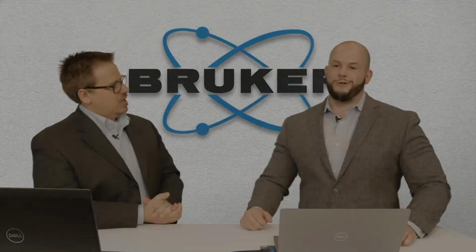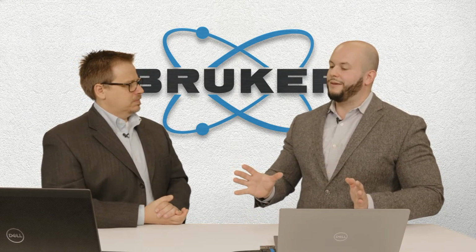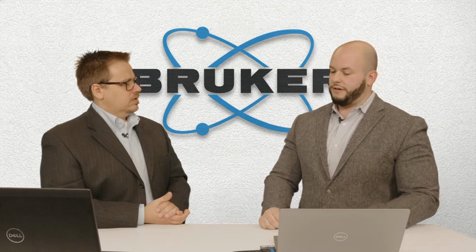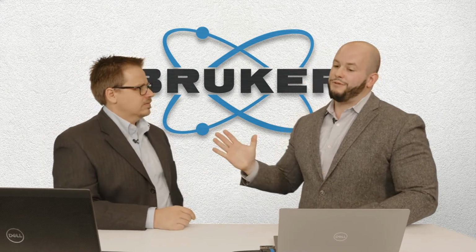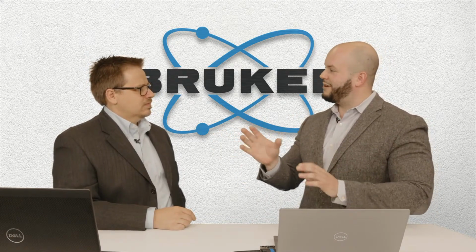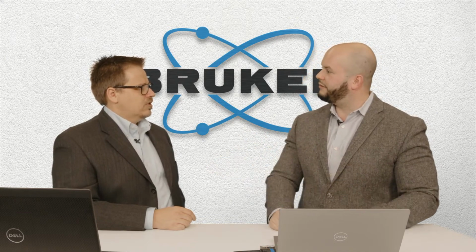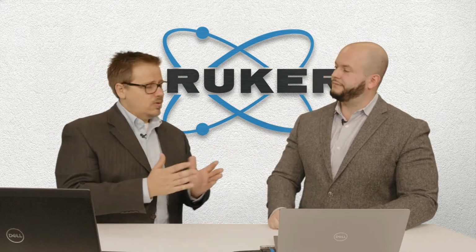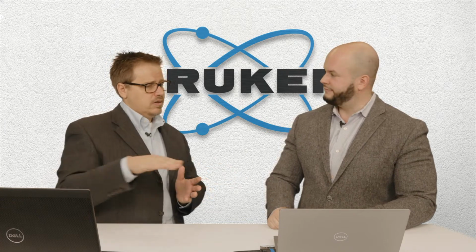Great question. In terms of a detector, in cases where you're not too worried about instrument peak resolution, which is in a lot of cases with polycrystalline metals, I prefer to push the detector as close as possible, so then we don't need to capture as many regions of the rings. The rings are effectively smaller, closer to the sample. Yeah, if you put it really close, you're going to get a lot of coverage. You can get something like 20, 40 degrees of 2 theta in one shot, and that also gives you more of the angular coverage.